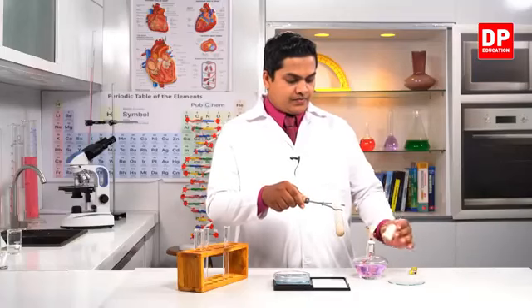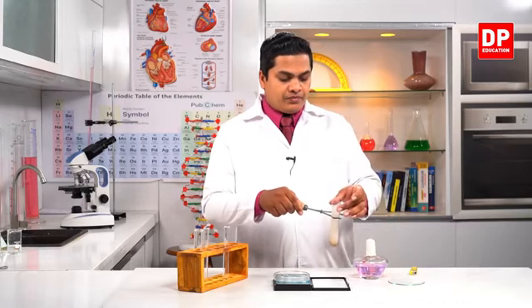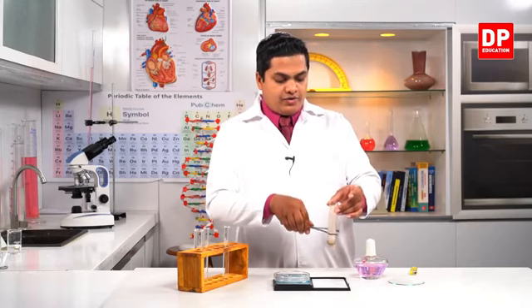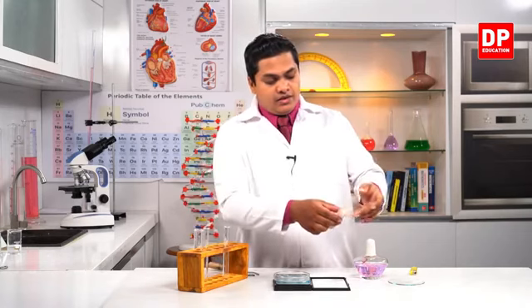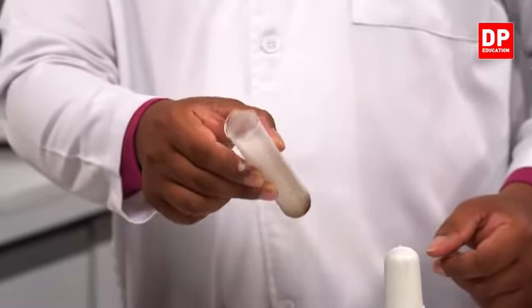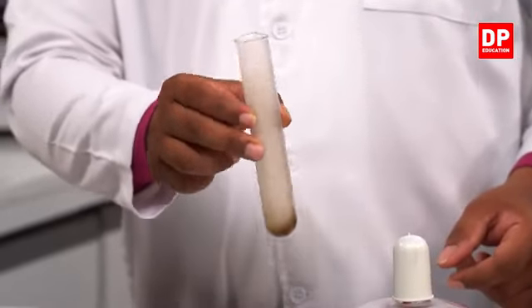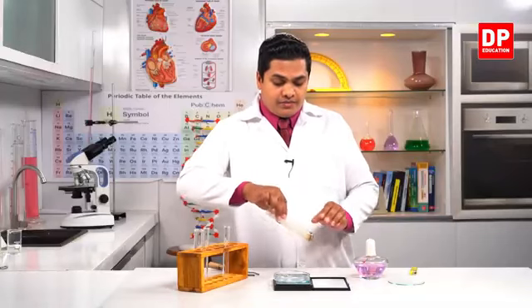Right. So now I'm going to take away the boiling tube. Here you can see smoke is getting emitted. See, smoke getting emitted means that a chemical change has occurred in this system. Now let's measure the mass of the system right now.